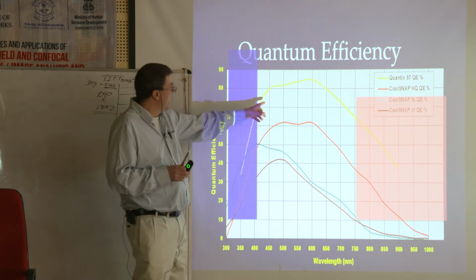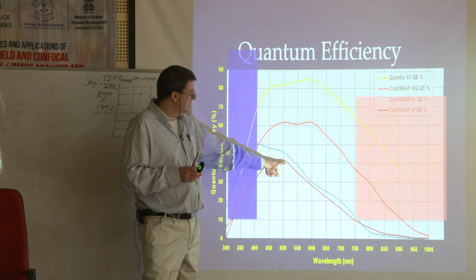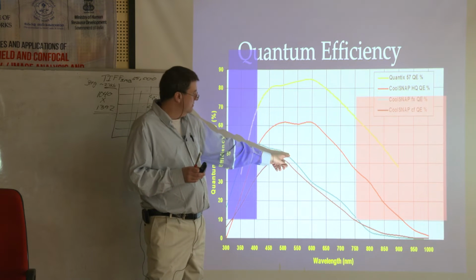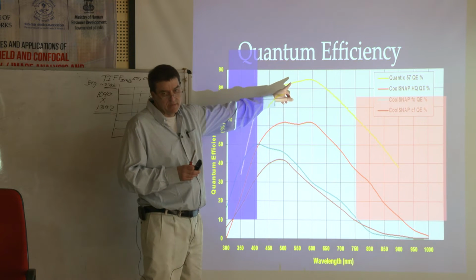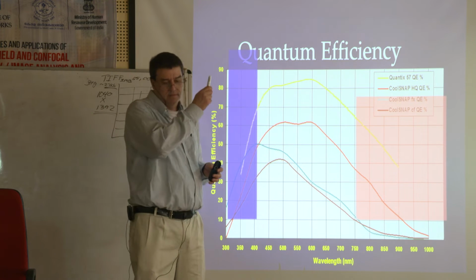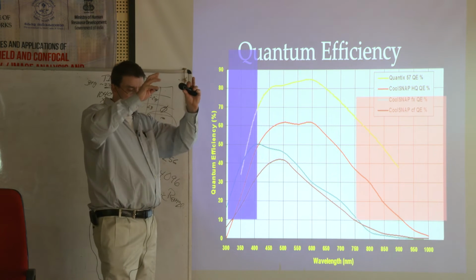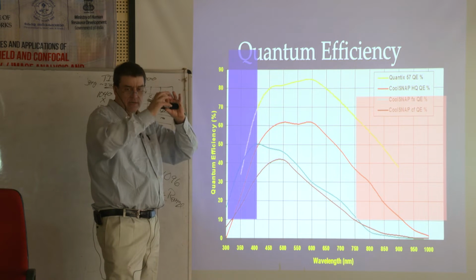This would be probably a back-thinned camera like I talked about a little bit ago. Okay, a camera like this, $8,000, $10,000, yeah, maybe $15,000. These are $40,000 cameras, with these chips that are made to be so efficient. Because as we saw in his talk yesterday, remember that talk where he had this big, it looks sort of like a bunch of squares, and he's saying it was the Golgi apparatus, things going in and out?